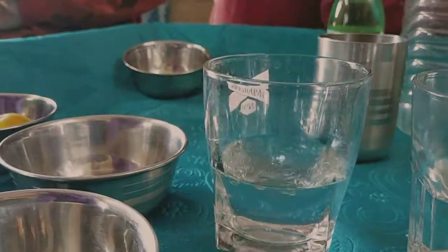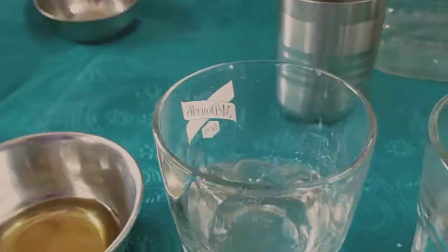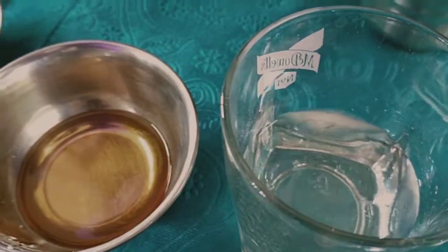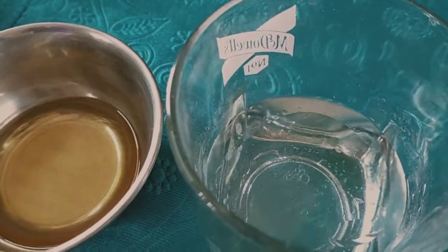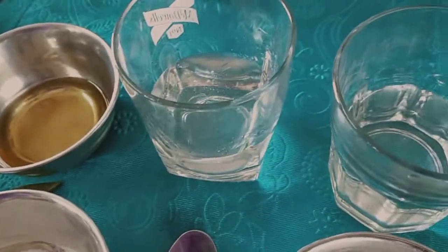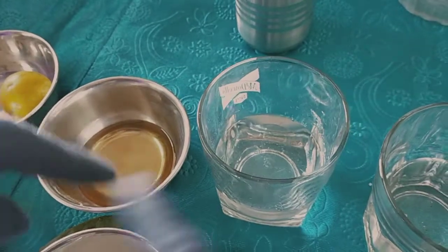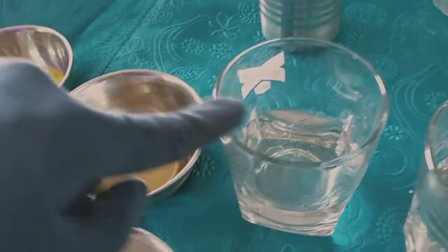Did it get mixed? No, teacher. No. You can see from up also. It did not get mixed. It is forming one separate layer on the water. It is not getting mixed. That means it is immiscible. It is not mixing with the solvent. This liquid is not mixing with this liquid.